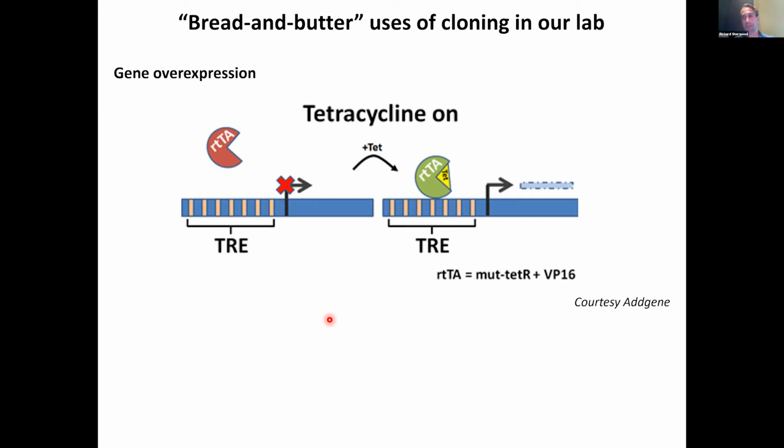Somewhere else in our plasmid, we'll either have lentiviral LTRs, which allow the lentiviral system to integrate randomly into the genome of cells anything that's in between the two LTRs of the lentivirus.